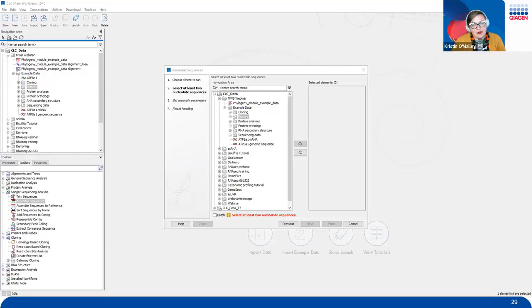So the next thing that we're going to be doing, so we've created our primers for our cloning experiment. The next thing that we're going to do is we want to add in some restriction enzyme sites onto the ends of our primer, so we're able to stick that insert into our vector.